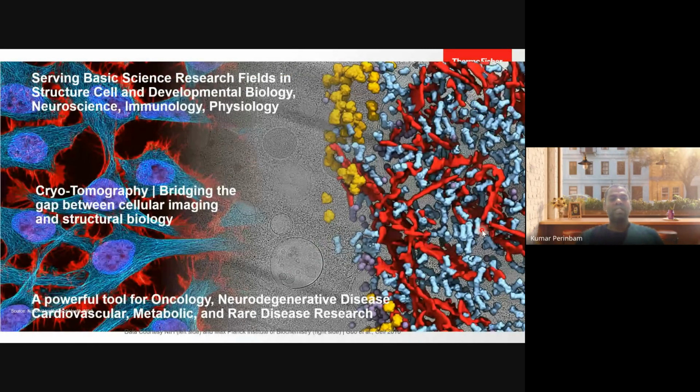So what do we see in cryo-electron tomography? Initially in electron microscopy you see individual proteins or biomolecules. Now people are interested in seeing how an individual molecule is sitting within the cell, and how the other biomolecules of the cell are interacting with each other. You can see the beauty of the entire life interaction happening within the cell in a single snapshot. Before this, we used to put a GFP or RFP inside the cell and use a fluorescent microscope to see the image.